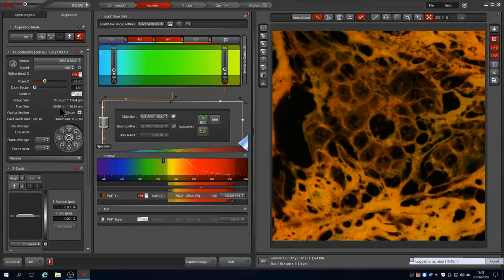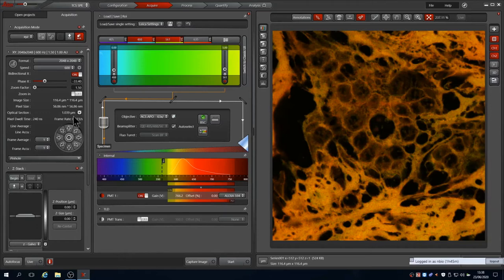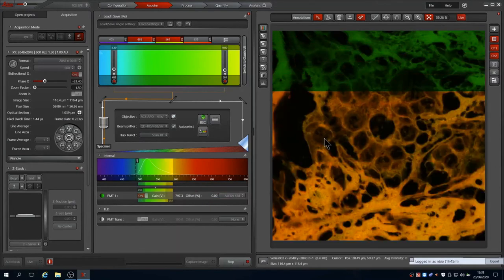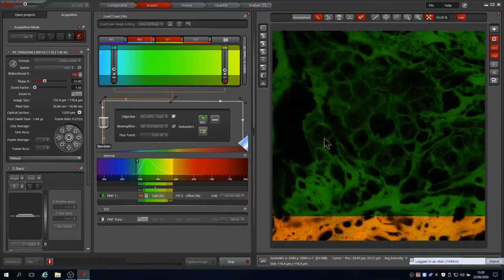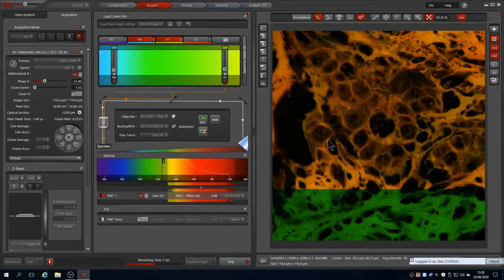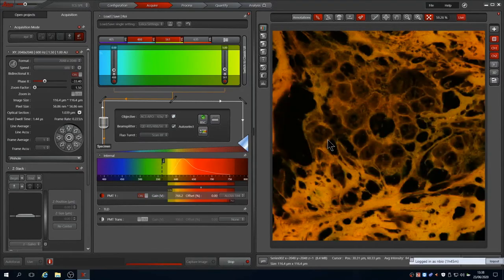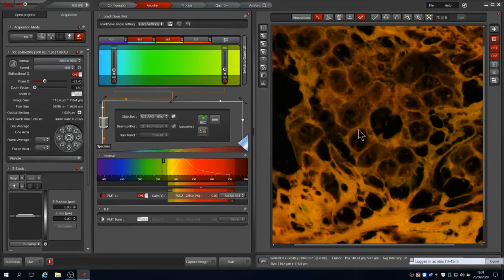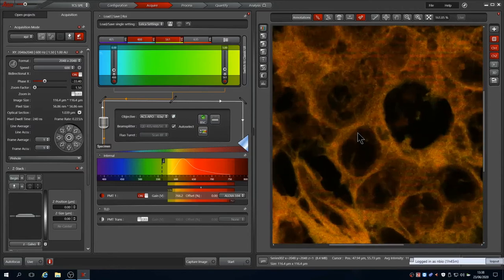You can check this by using a Nyquist calculator, such as the one provided on the SVI website. Now if we press start, the images take longer to scan, but at a higher resolution for the same field size. It looks better, but using the scroll wheel we can zoom in and the shot noise from the PMT is evident, especially on the green channel where we used a higher PMT gain.